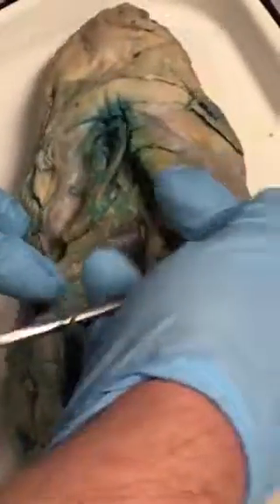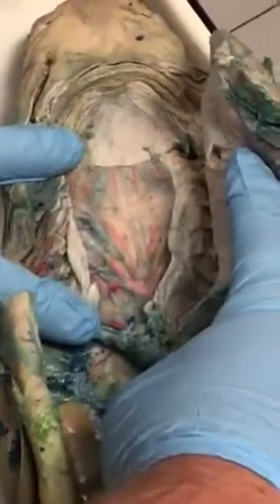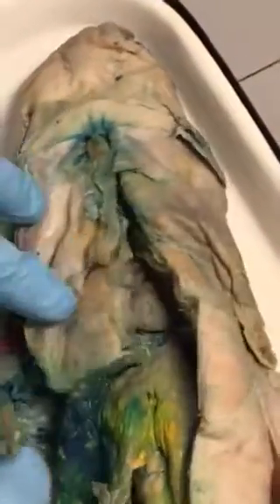What are the things that split off again called? Afferent branchial arteries. And then the efferent ones are these little red ones here. Okay. Well, I guess they're not that little, but yeah, they're nice.